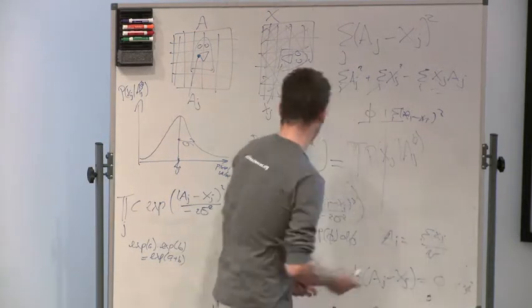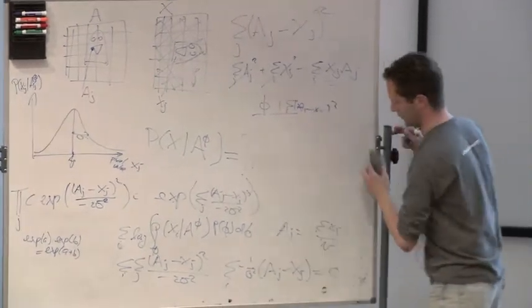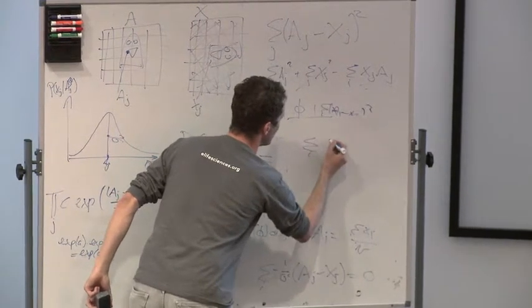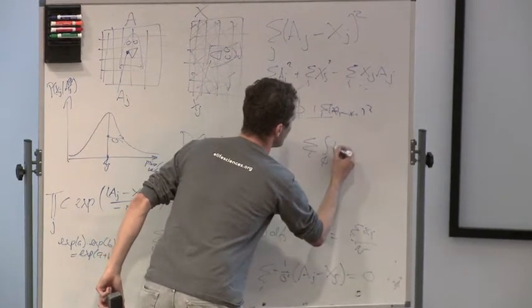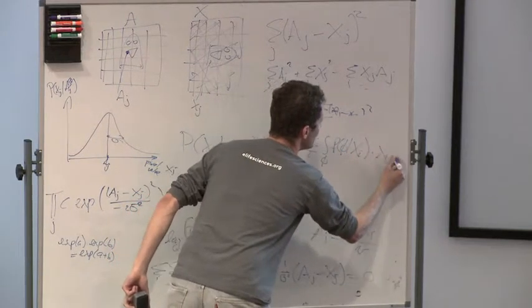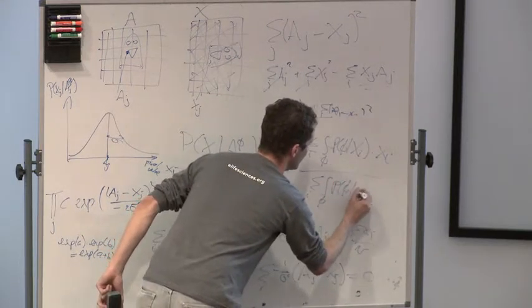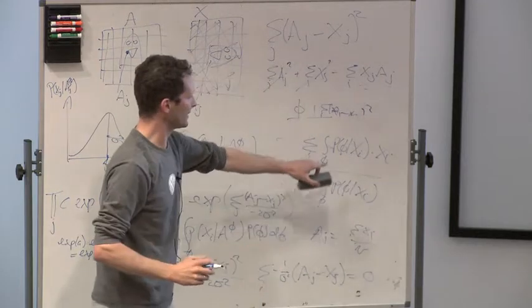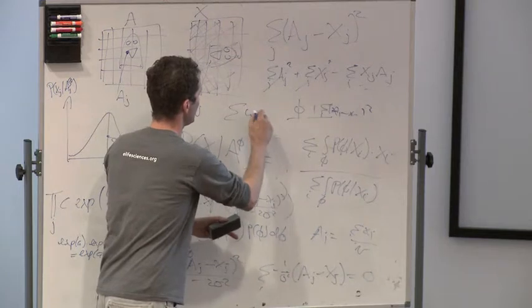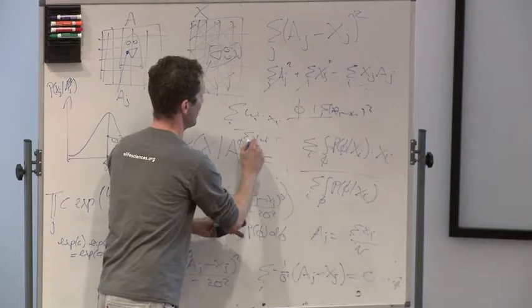where the average of the particle is not just a straightforward average of the particles which are aligned, but something like a summation over all the particles and then some integral over the probability of having that, and I won't go into detail, divided by the same with p of phi, x. What that means is this is a weighted average, of the formula: sum of weight i times xi divided by sum of weight i.